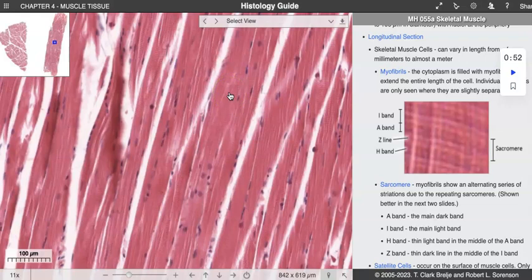And also remember, we do have different animal slides, right? You may have human or rabbit or something of that nature, so they might look a little bit different. So again, try to compare your slide to maybe a couple of the other ones in the lab, just to get a different view of how these striations can pop up into view.